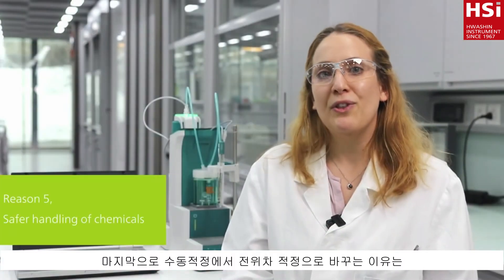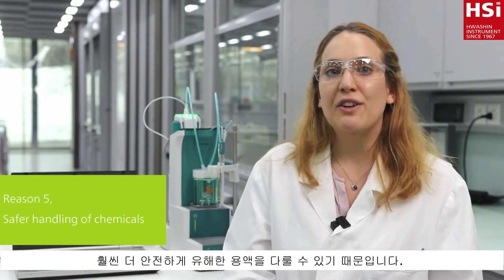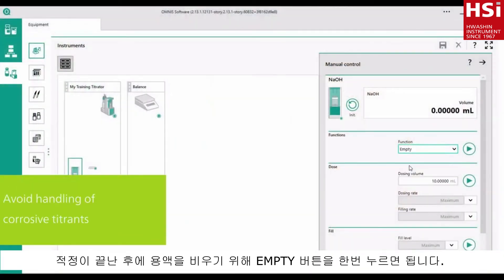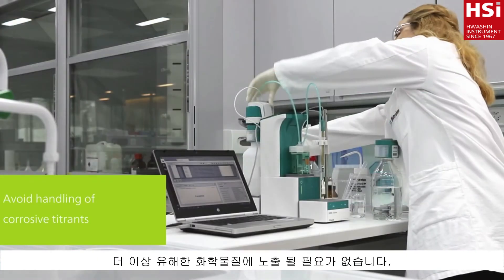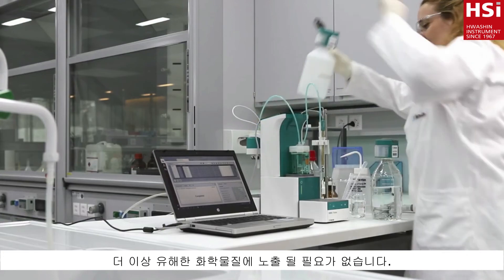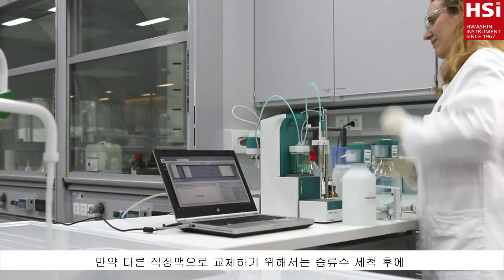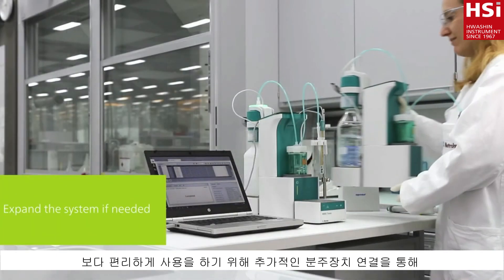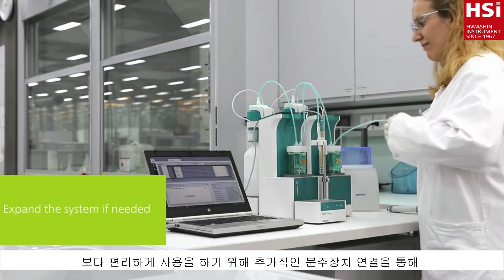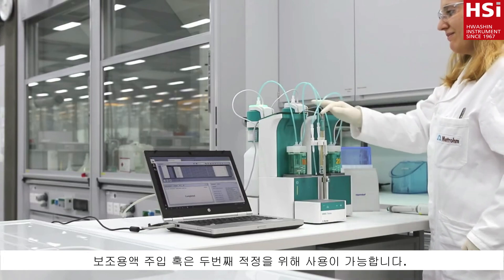My fifth and last reason for changing from manual to automatic titration is that handling of chemicals has become much safer. When you are done with the titration, you can empty the burette at the touch of a button. No exposure to corrosive or toxic chemicals. If you would like to use a different titrant, simply refill your burette with the new titrant after automatic rinsing. For more convenience, you may want to expand the system with an additional burette for a second titration or to add an auxiliary solution.